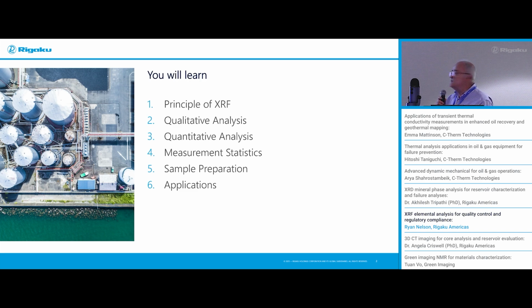So we're going to cover the principle, qualitative analysis. We're going to try to optimize settings and hardware conditions, anyone using WD, quantitative analysis, statistics, sample prep, and applications.